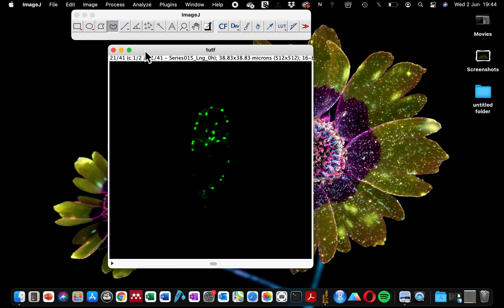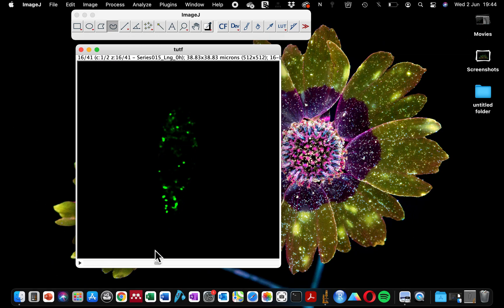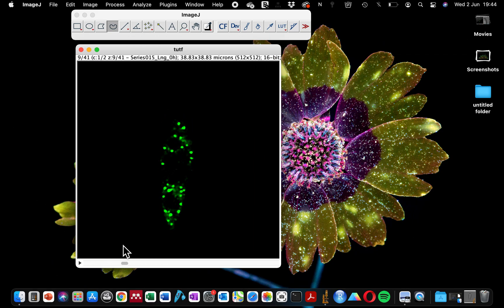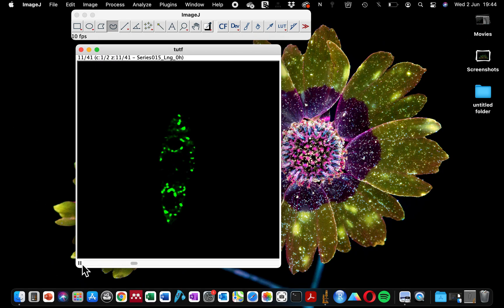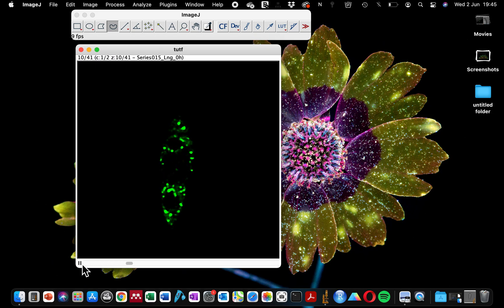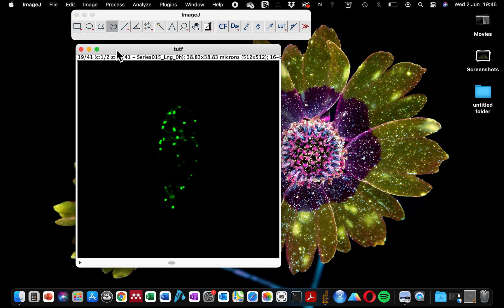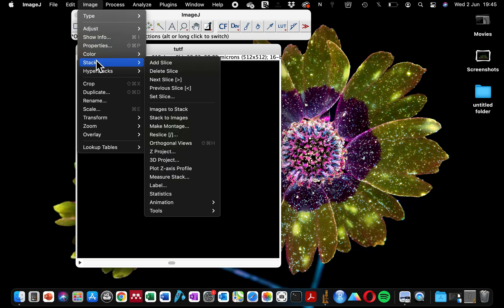Why is it important that you use color coding? It's not important, it's just that if you want to get extra information from your sample, then you can use the color coding function. You can see I'm going to play this Z-stack and you can see that the objects that my sample is localized to are at different Z-stack positions.